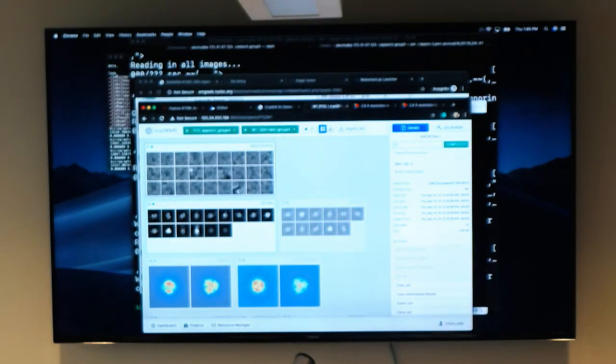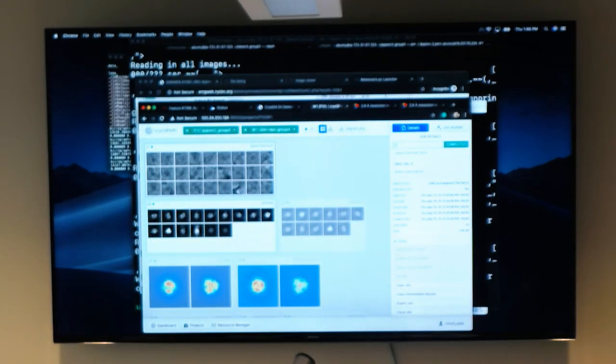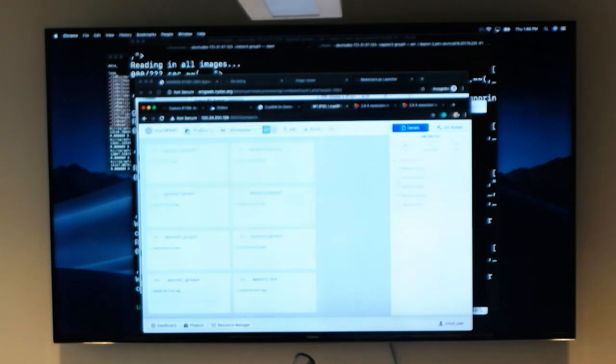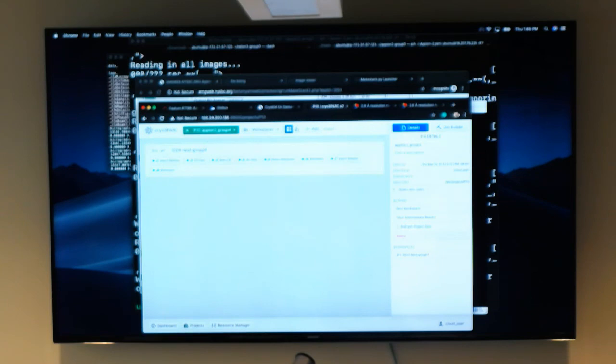So group 4 imported particles. If you look at the different views, right now if you go into this view, that may be helpful because it organizes the data tree, the workflow of what's going on. Something I didn't go over is how CryoSPARC manages things. If you go all the way back, you can see there are different projects, and within the project are different workspaces.